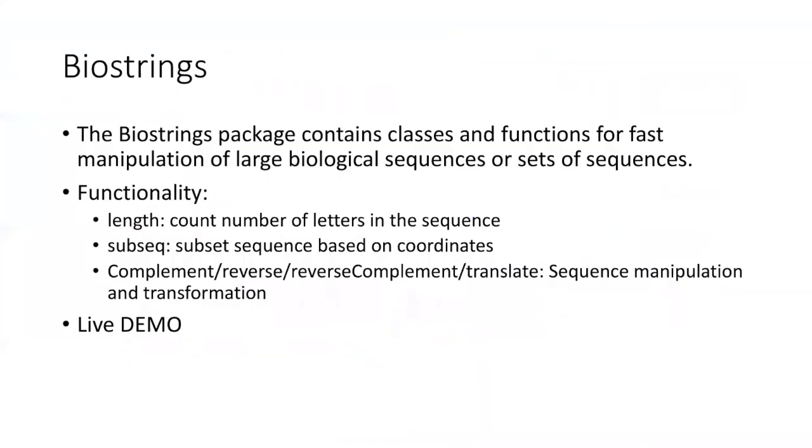So this is a live demo for Biostrings. No worries, I will give more live demos for other stuff later, so it's going to be more interesting coming along. This is pretty much what I want to say about Bioconductor. Because everybody's analyses are very different, everybody will use different packages. You probably won't use this package in the future, but you will use some other packages. The basic concept of getting to know a package, reading the function description, and trying to use their functions to realize some of the tasks is pretty similar. You can try to replicate this for other packages as well.